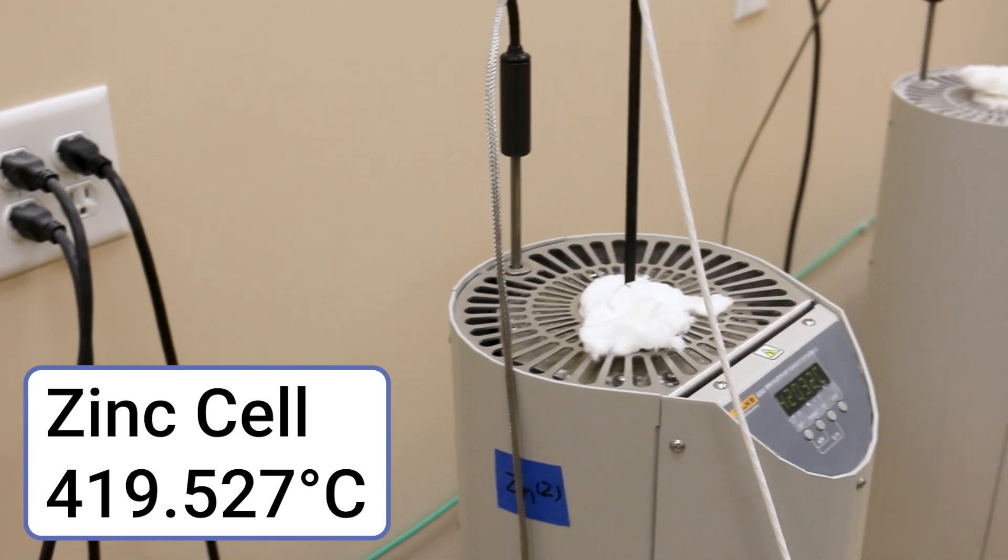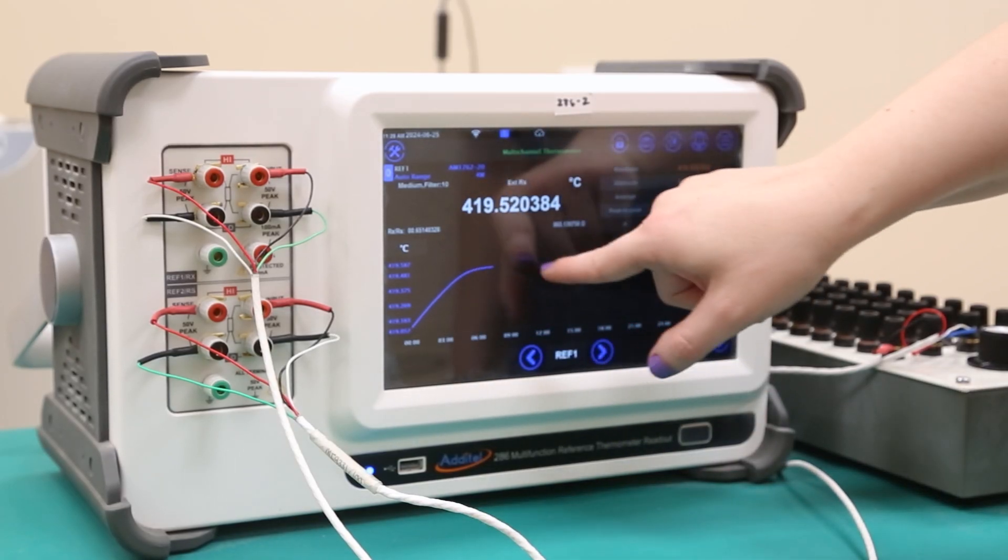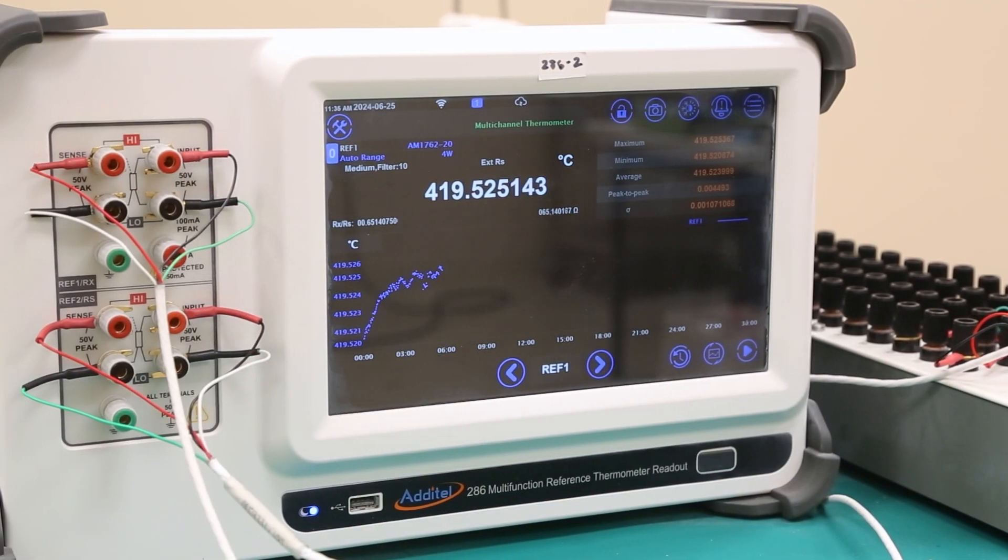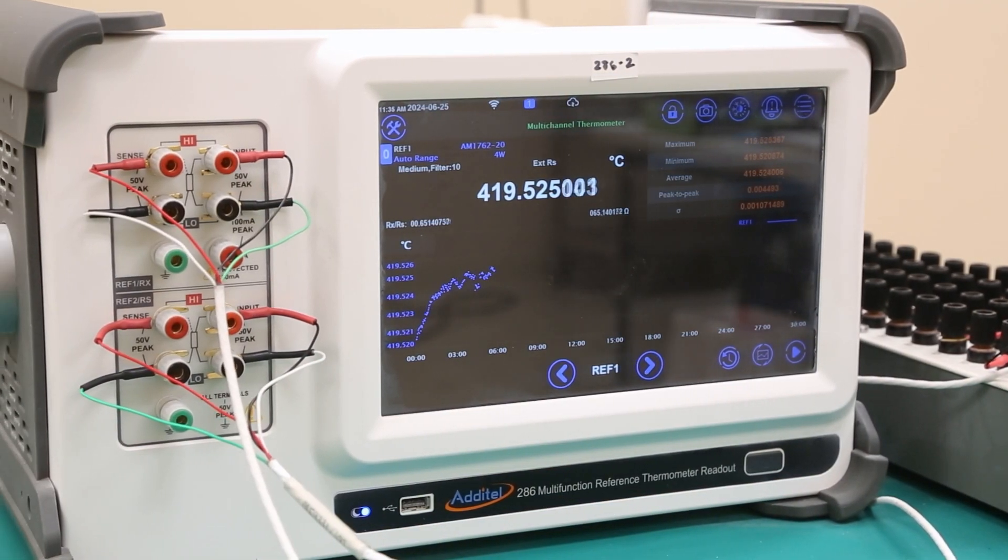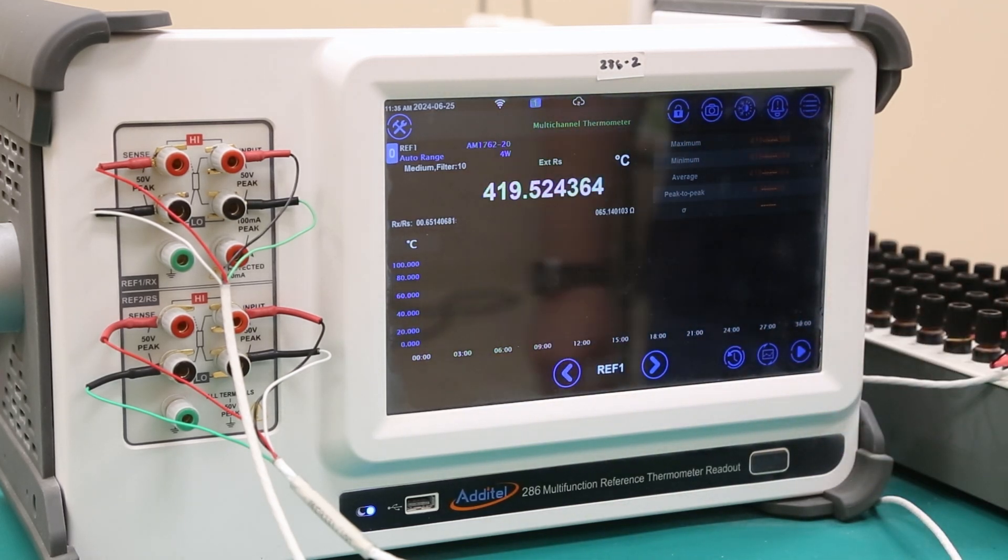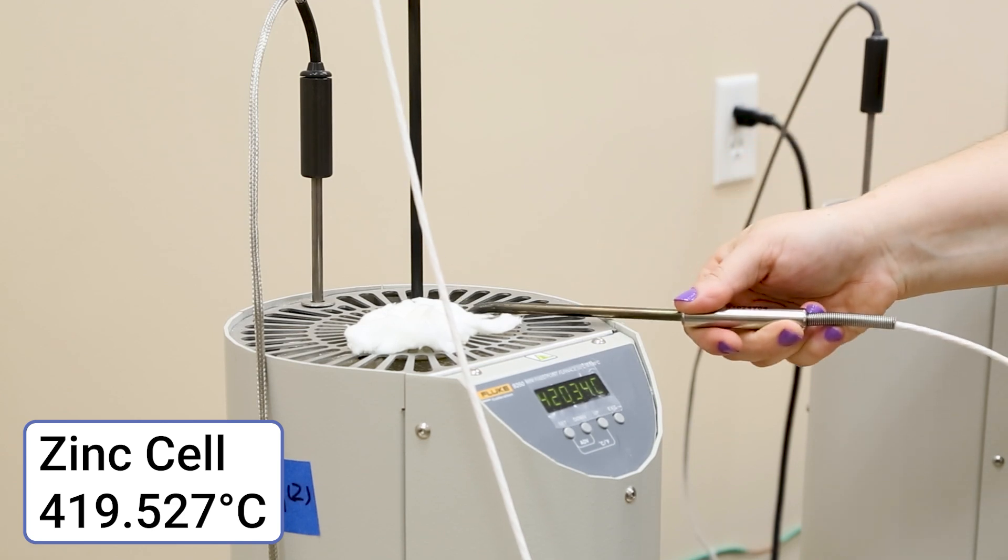You should also connect the reference thermometer to the REF1 wire. Now insert the reference probe, also called the check standard, into the zinc cell. Every few minutes, we will reset the thermometer statistics to resize the y-axis on the screen. This will help us identify when the temperature has plateaued enough for calibration, as shown by the temperature graph leveling off horizontally over time. At this time, you should also insert the first DUT probe in the preheat well of the furnace.